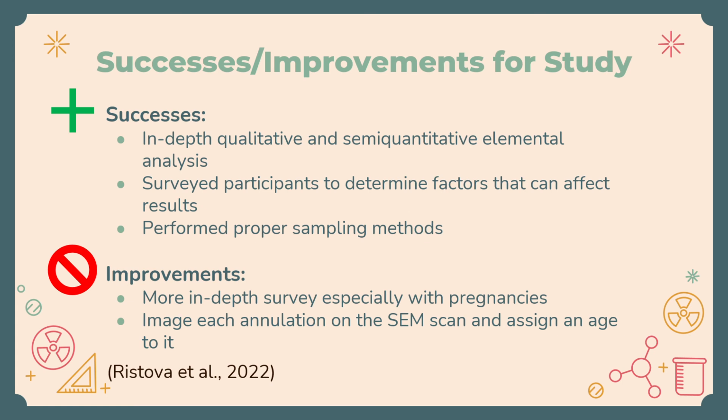As for the successes and improvements for this study, as far as the successes, I think the study was very thorough and in depth with the qualitative and semi-quantitative, or fingerprinting, elemental analysis. They even surveyed their participants to get a general overview of who they were working with and the unique traumas that each of the donors had been through. And the researchers performed the proper sampling methods for each of the tooth samples that were used.